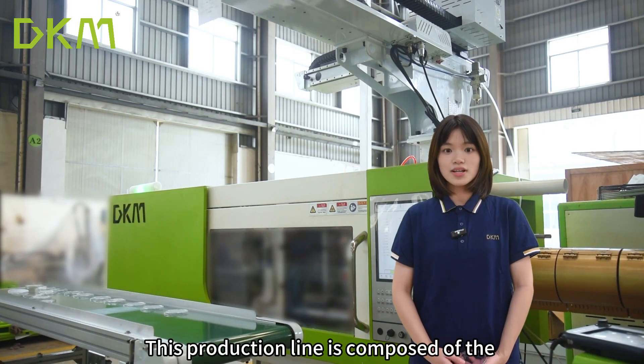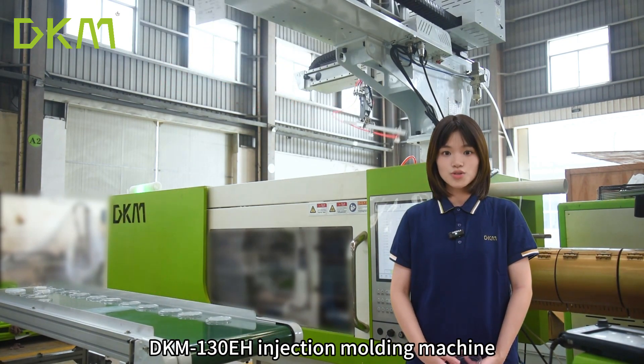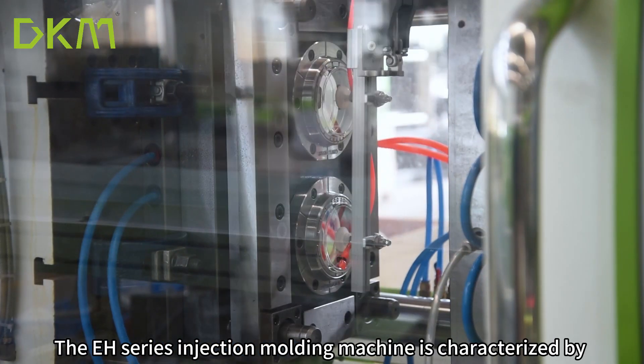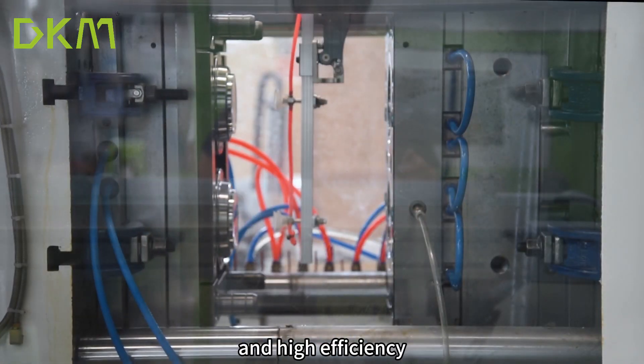This production line is composed of the DKM 130-ton EH injection molding machine, thin mold, and robotic arm. The EH series injection molding machine is characterized by high cleanliness, high precision, and high efficiency.